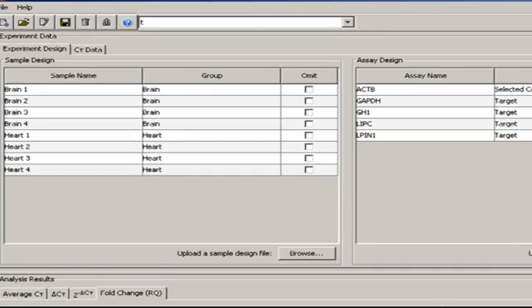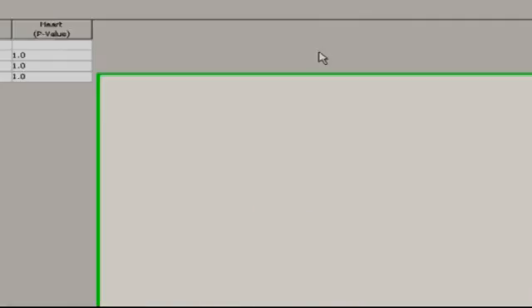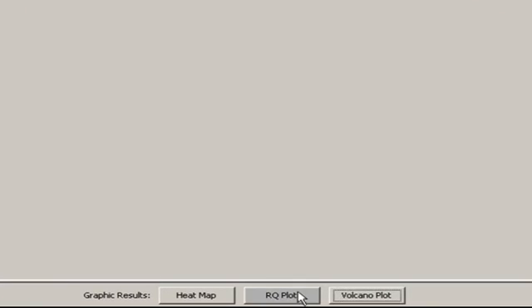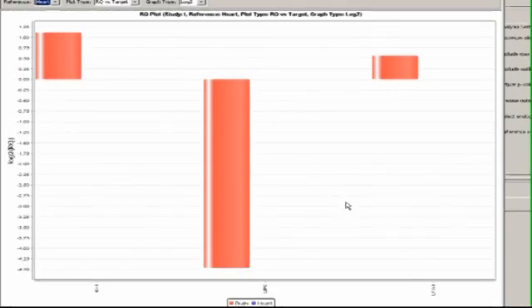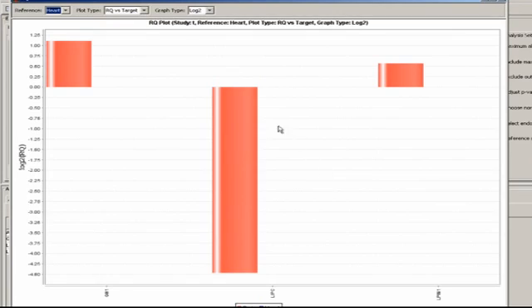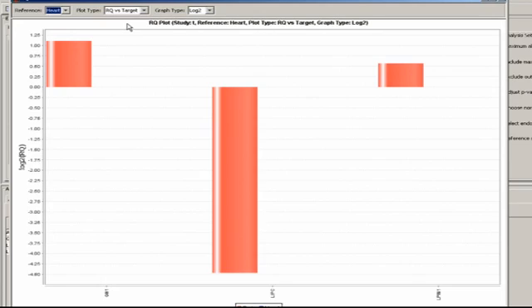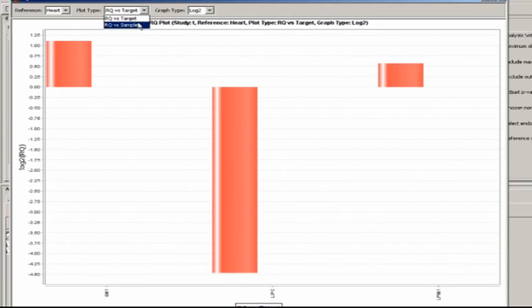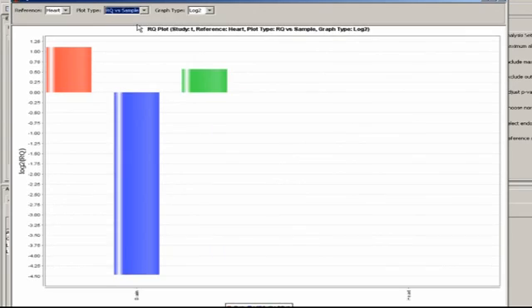The RQ plot is where we can visualize our fold changes, which are also represented mathematically under the Relative Quantity, or Fold Change tab, that we looked at earlier. Under Plot Type, you can change the way the expression bars are presented, from relative quantities versus targets to relative quantities versus samples.